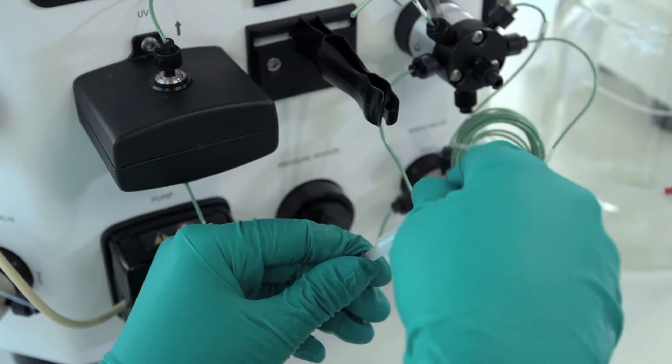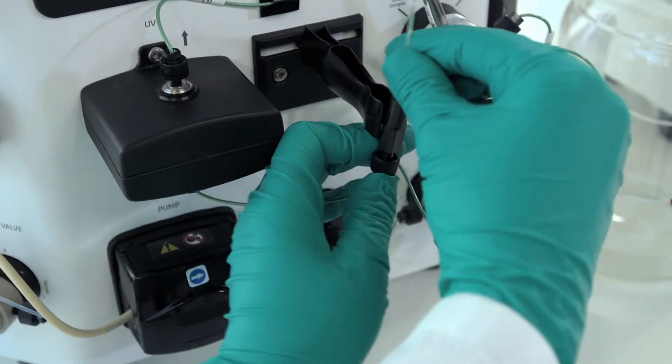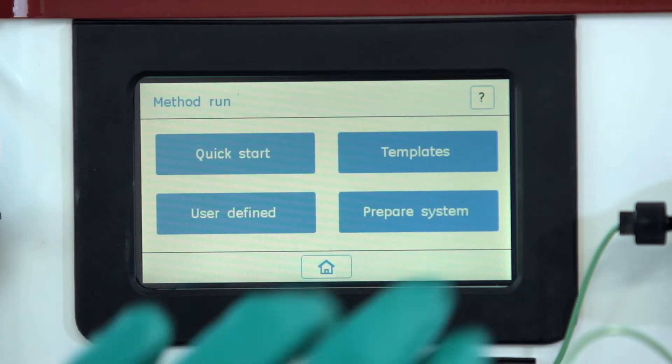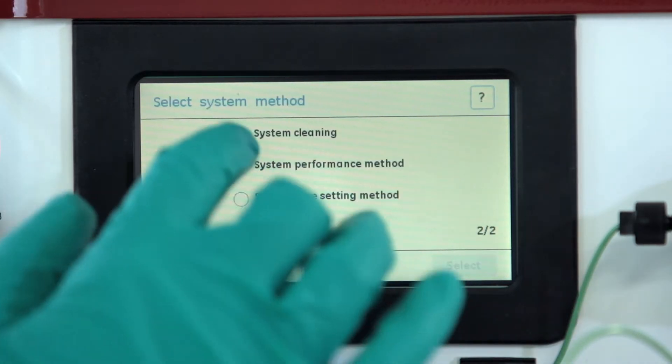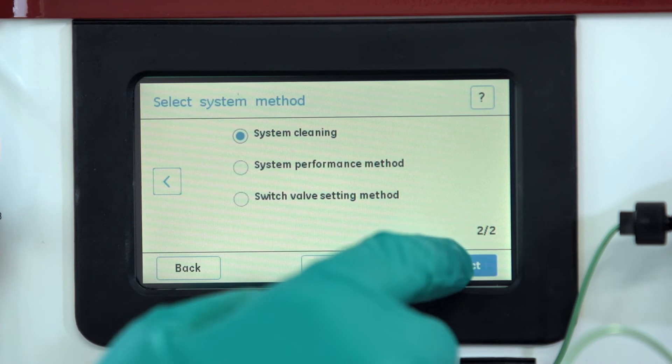Maintenance of the ECTA-START system is easy. The system comes with built-in programs for cleaning and routine maintenance operations.